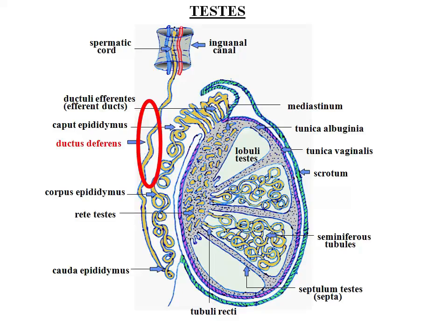Now again we come to the same testes diagram. Now we'll see the histology of the ductus deferens.